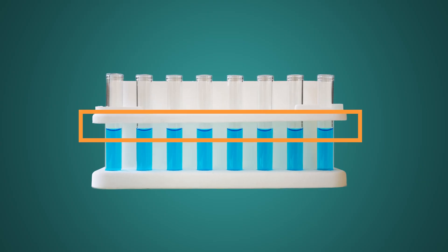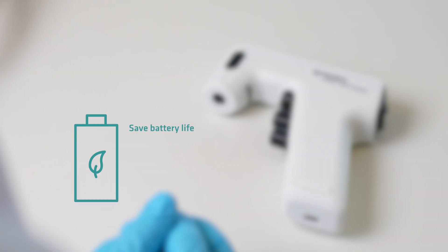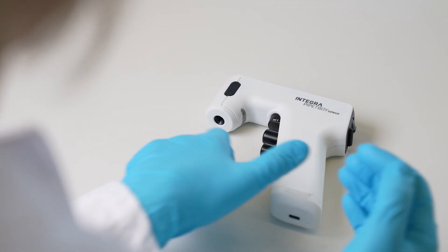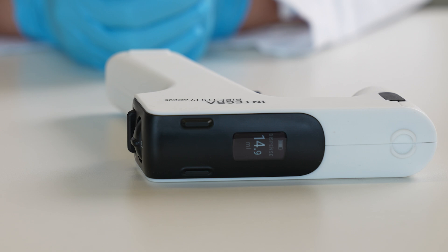To start, the Pipette Boy Genius has modes to save battery life. It will enter standby mode a few seconds after being put down and stay in this mode for 48 hours.